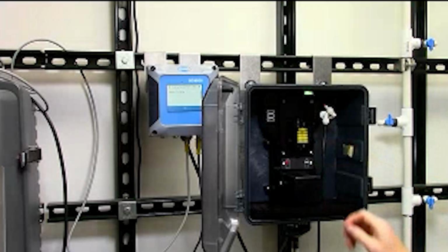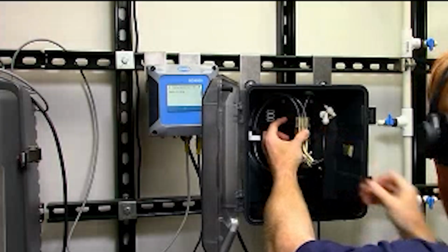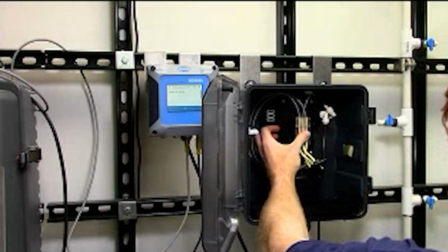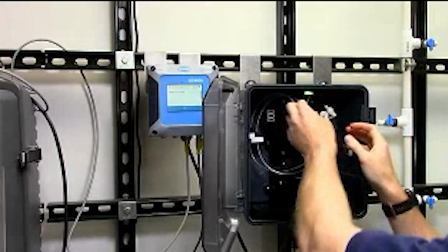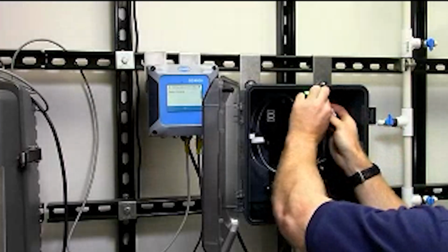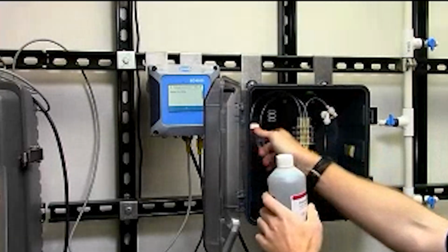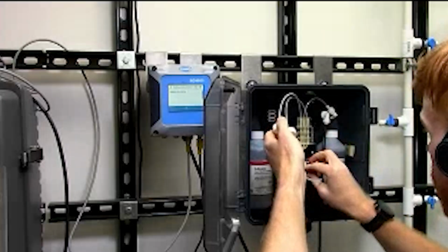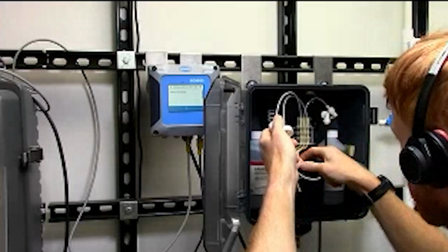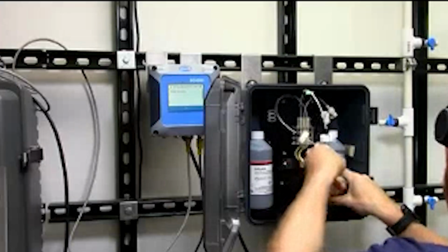But when you're done with your cleaning, place back in your new stir bar. You're going to attach your new tubing kit here and place on your pinch block. No more over tightening of the pinch block that you might have seen in the legacy instruments. I'm going to connect my sample stream to that flow meter and reinstall my reagents. And finally, I'm going to place all of this back the way it was.